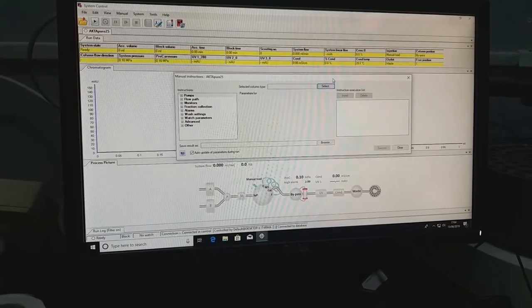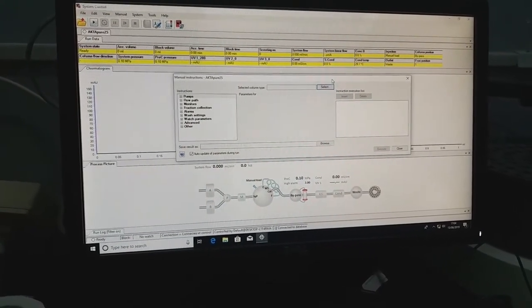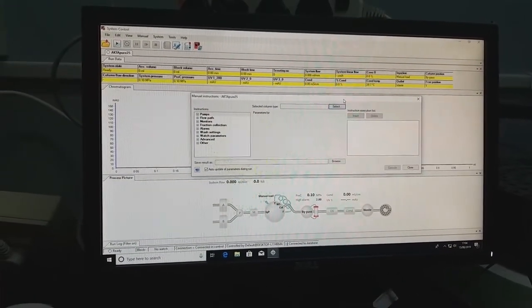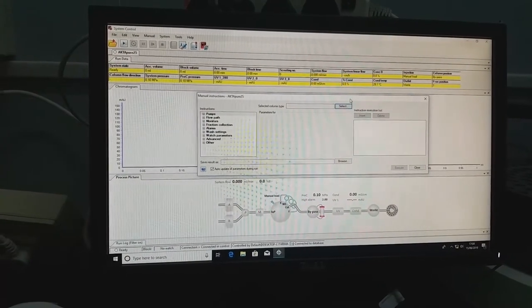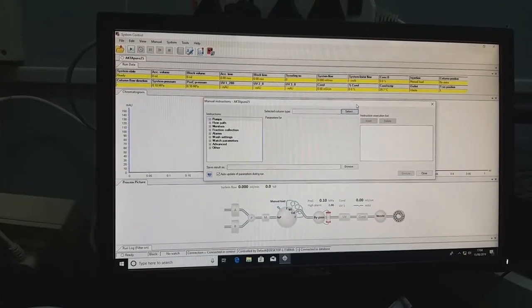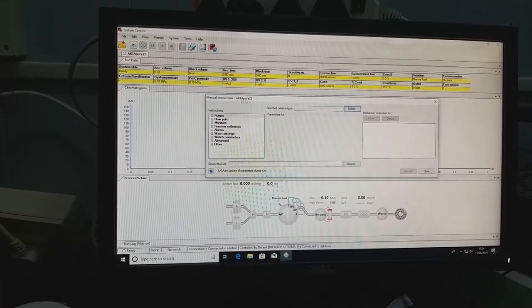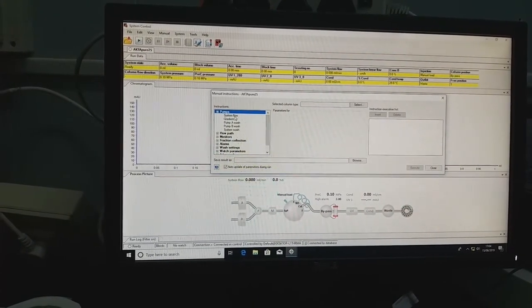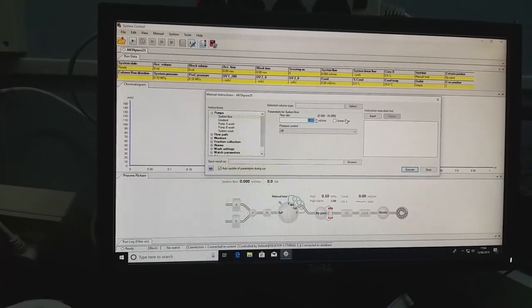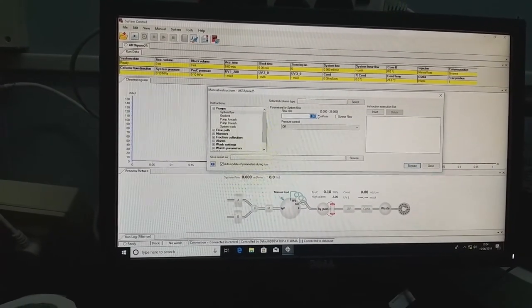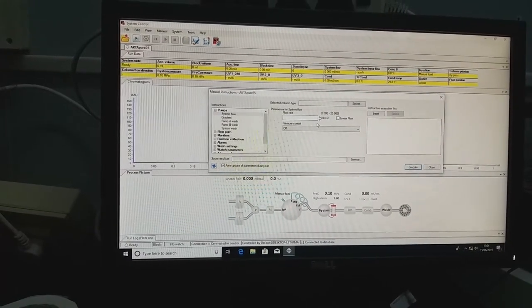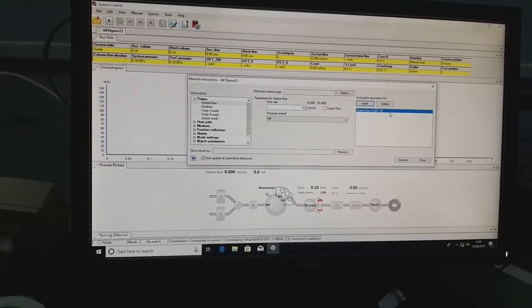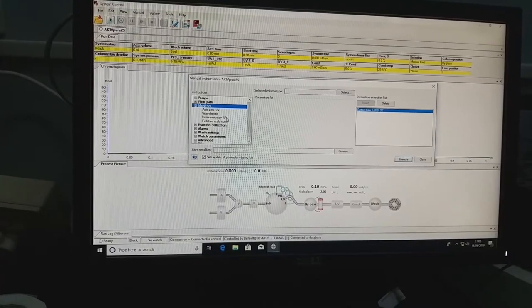Go to Manual — Execute Manual. This is the manual instruction dialog box where you can change various things. Here different parameters can be changed through this pop-up window, including pumps, flow path, and various parameters such as monitors. Go to Pumps — here you can change the system flow rate. We can keep up to 20 ml per minute if there is no column connected; under normal conditions you can keep 5 ml per minute.